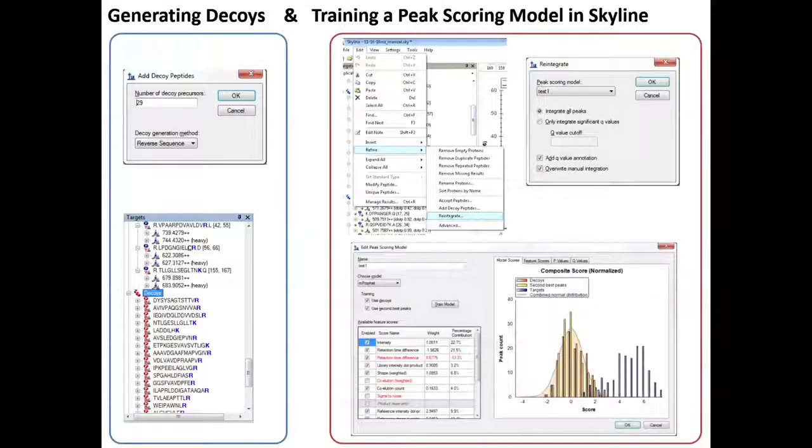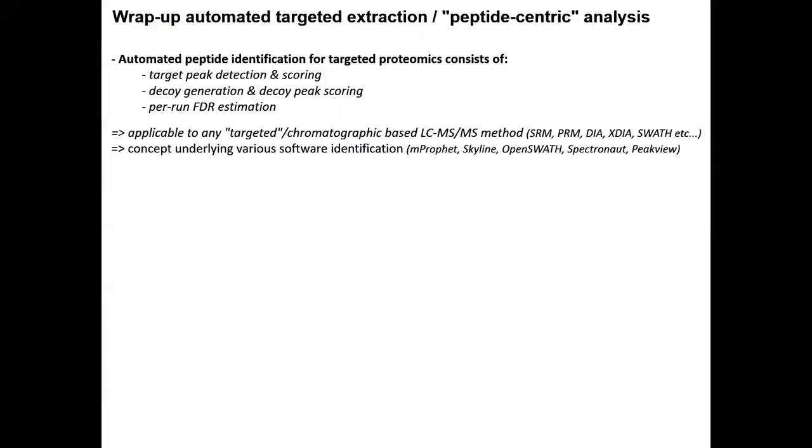And this is something that you can now nicely do in Skyline. You can generate the decoys directly in Skyline. You can directly score using these mProphet models or different models. You can see the scores which actually have the strongest weight, and the scores that are actually penalizing. You can see these distributions in the models, in the p-value and q-value histograms, etc. So I really encourage you to explore these windows, as you can really see if your model worked properly.